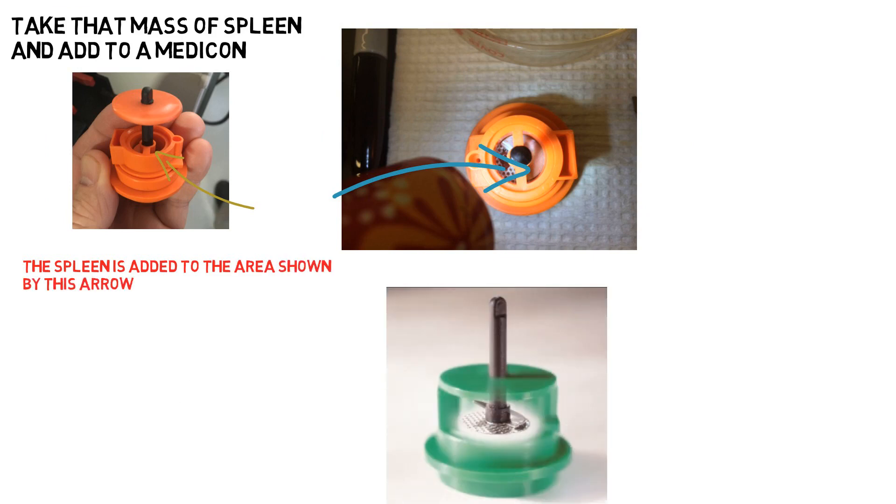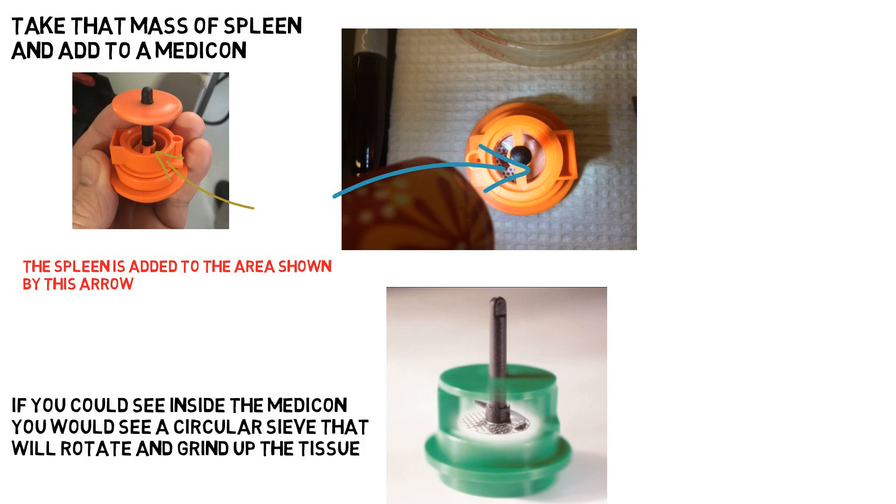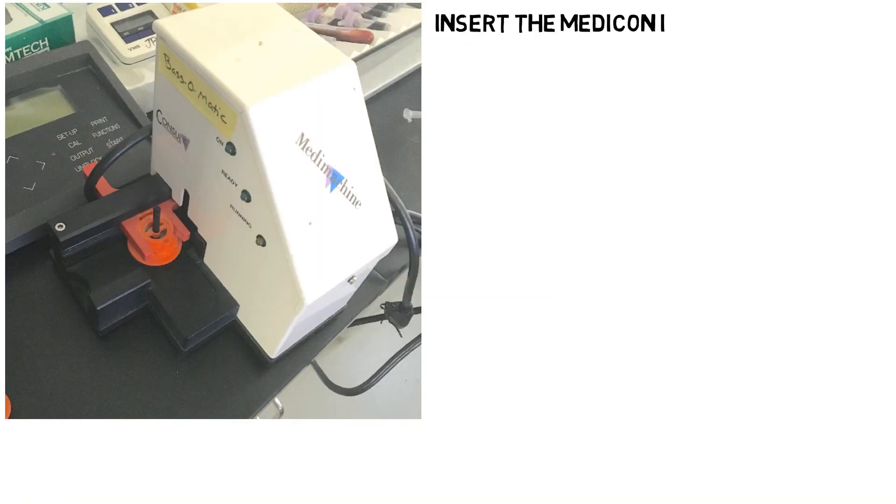The next step is to take the mass of spleen and add it to the Medicon device. Add the piece of spleen into the top opening of the Medicon as shown. You can see how the Medicon works in the green figure below. There is a circular sieve that will rotate and grind up the tissue into single cells. Add 1 ml of saline to the Medicon after you add the tissue. This will become the fluid which will contain the final cell suspension.